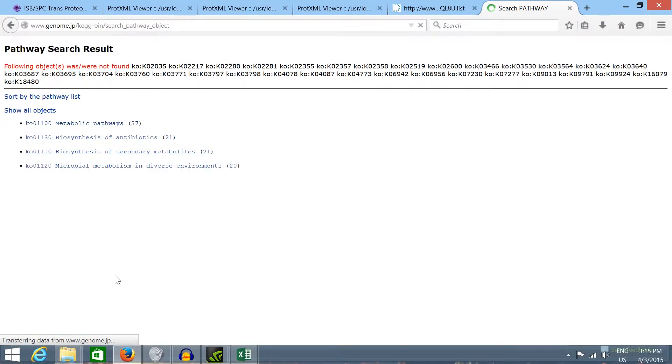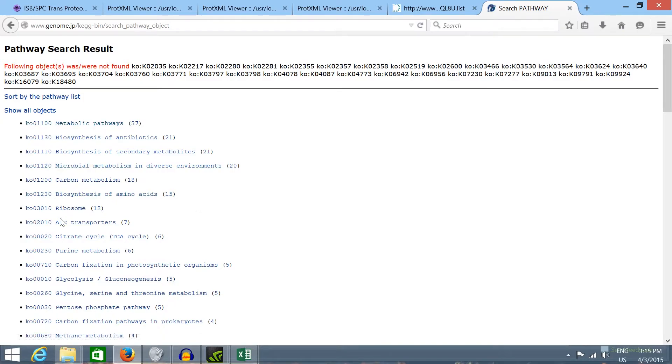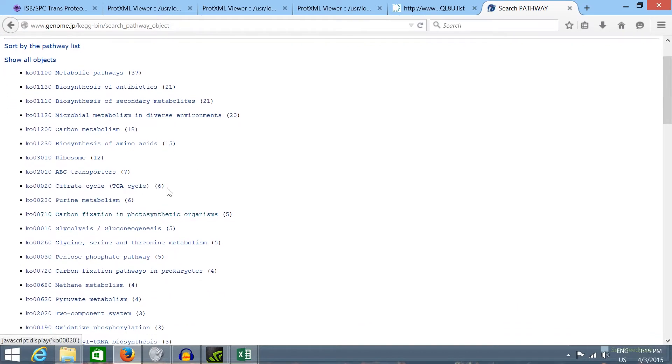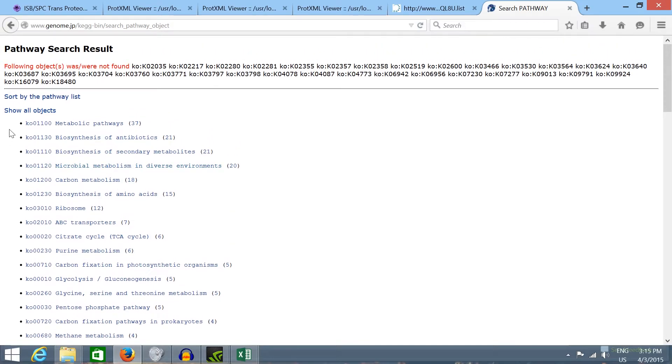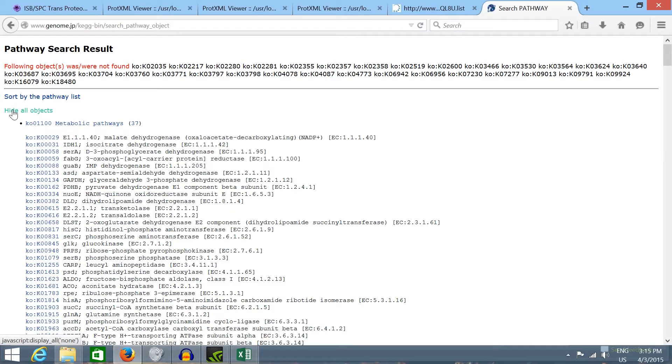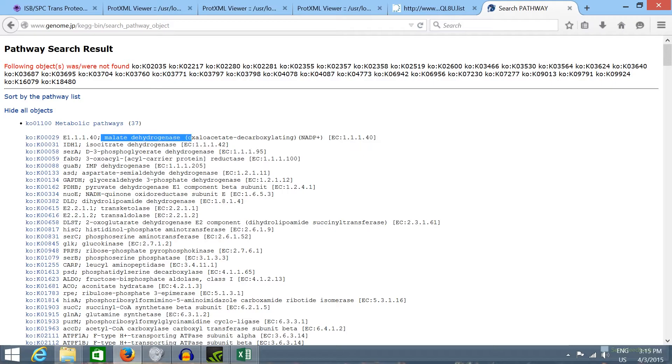KEGG will show a list of metabolic pathways that have enzymes from our proteomic data. If you click on show all objects, it will show all the gene or enzyme names involved in each metabolic pathway.